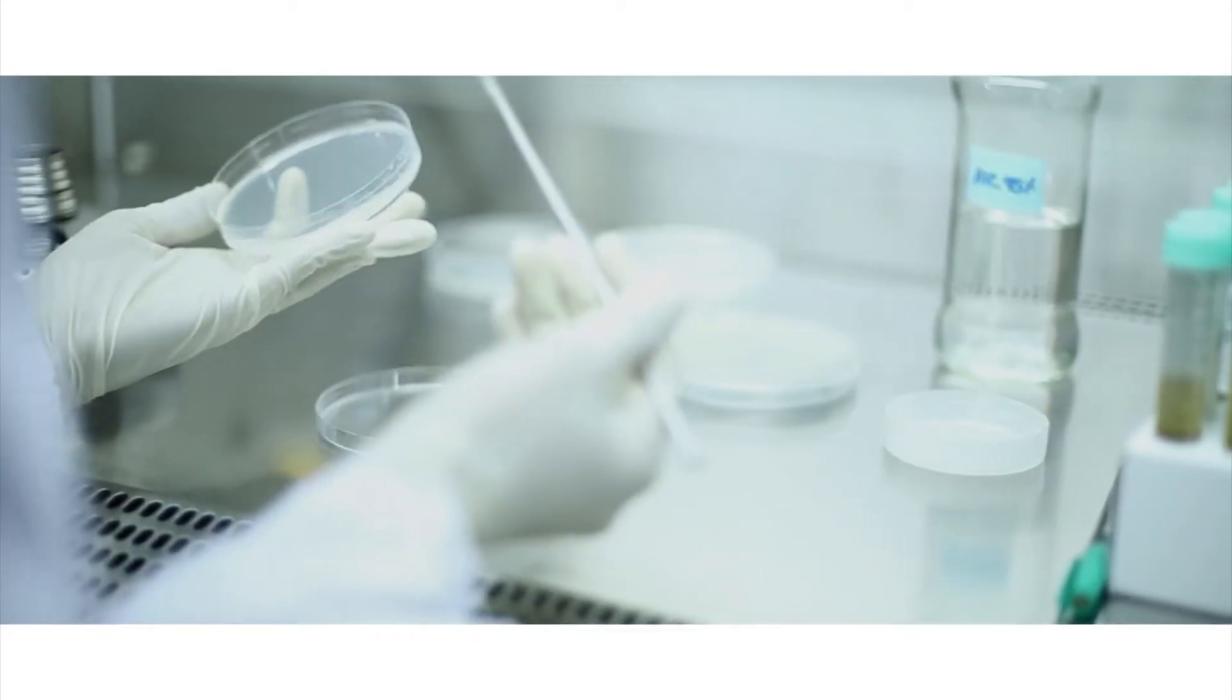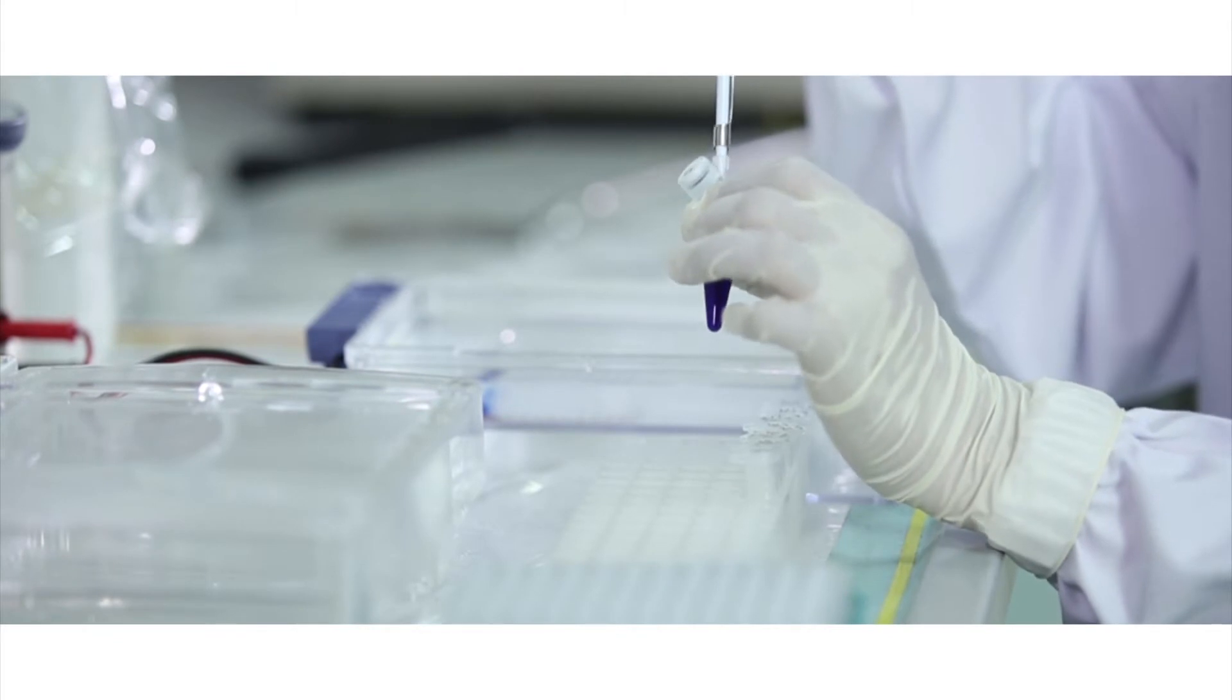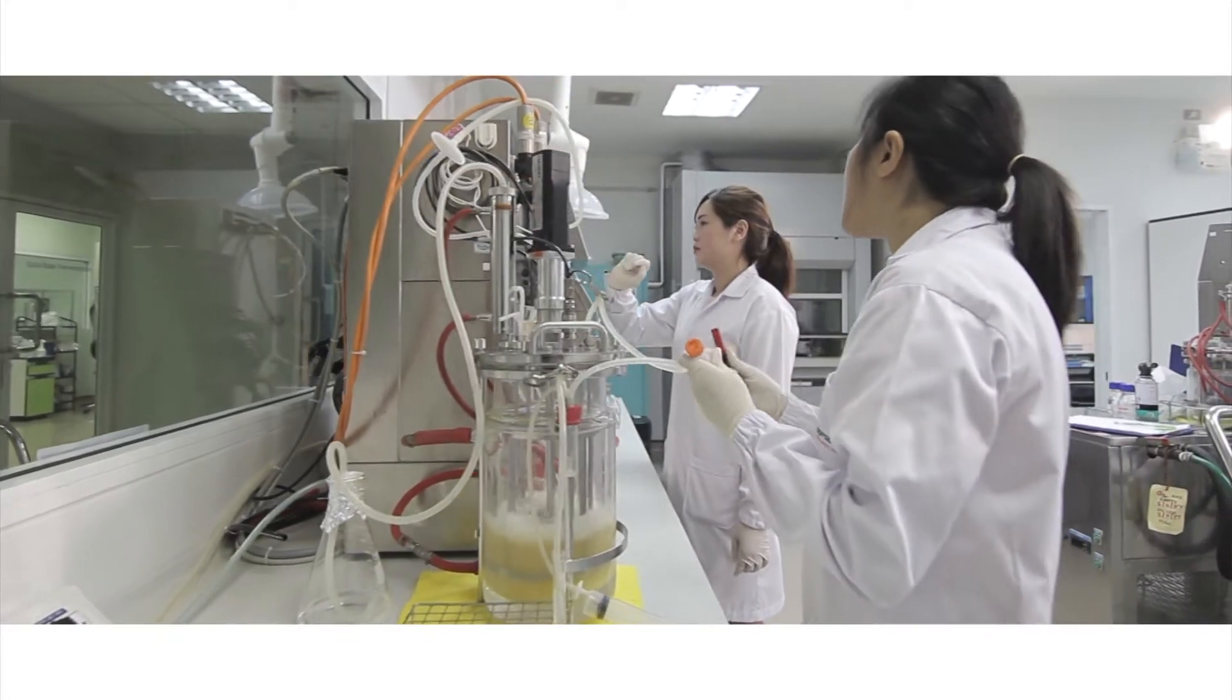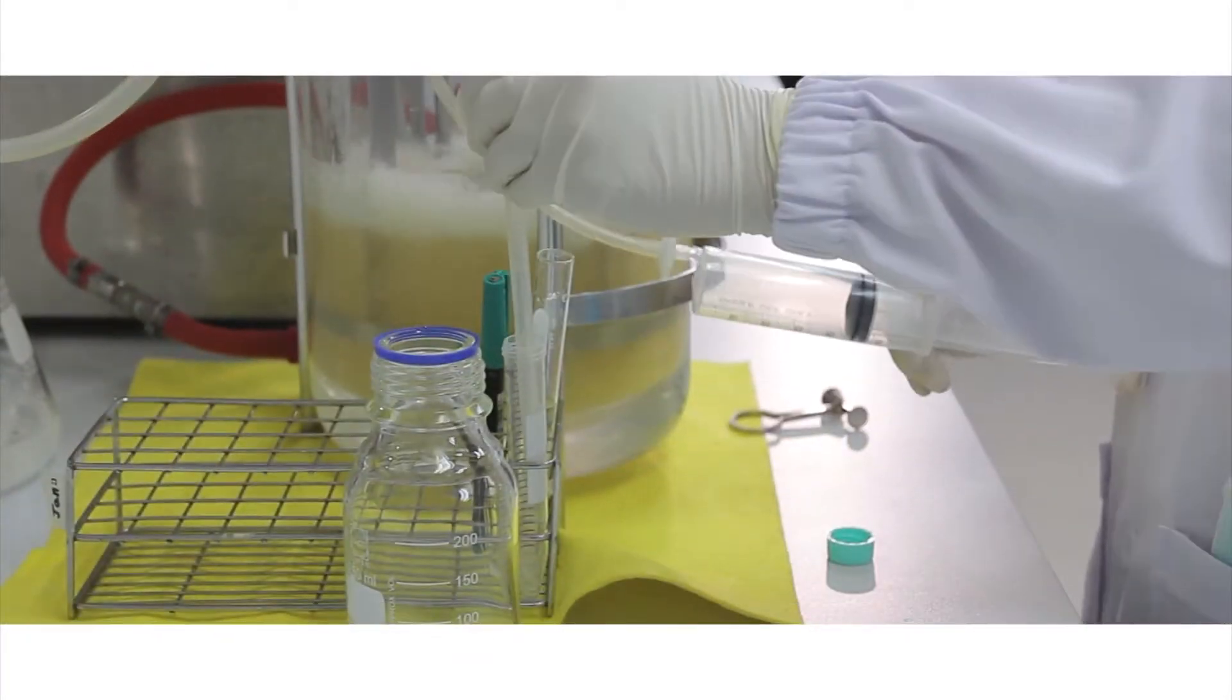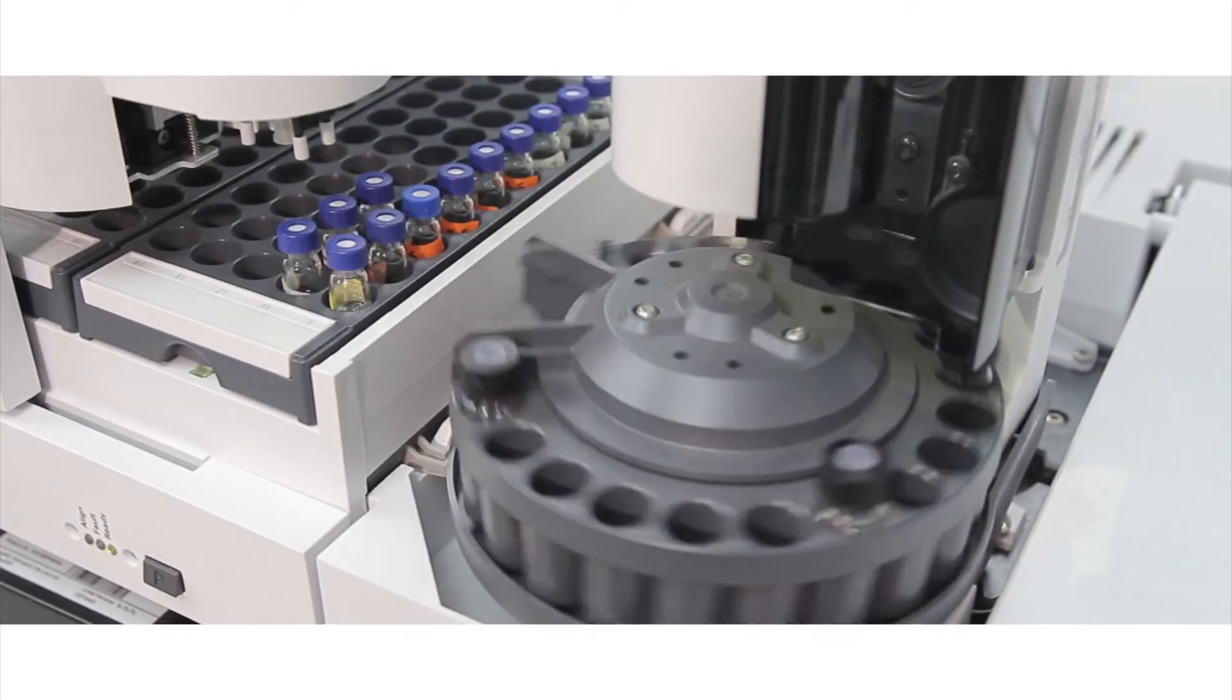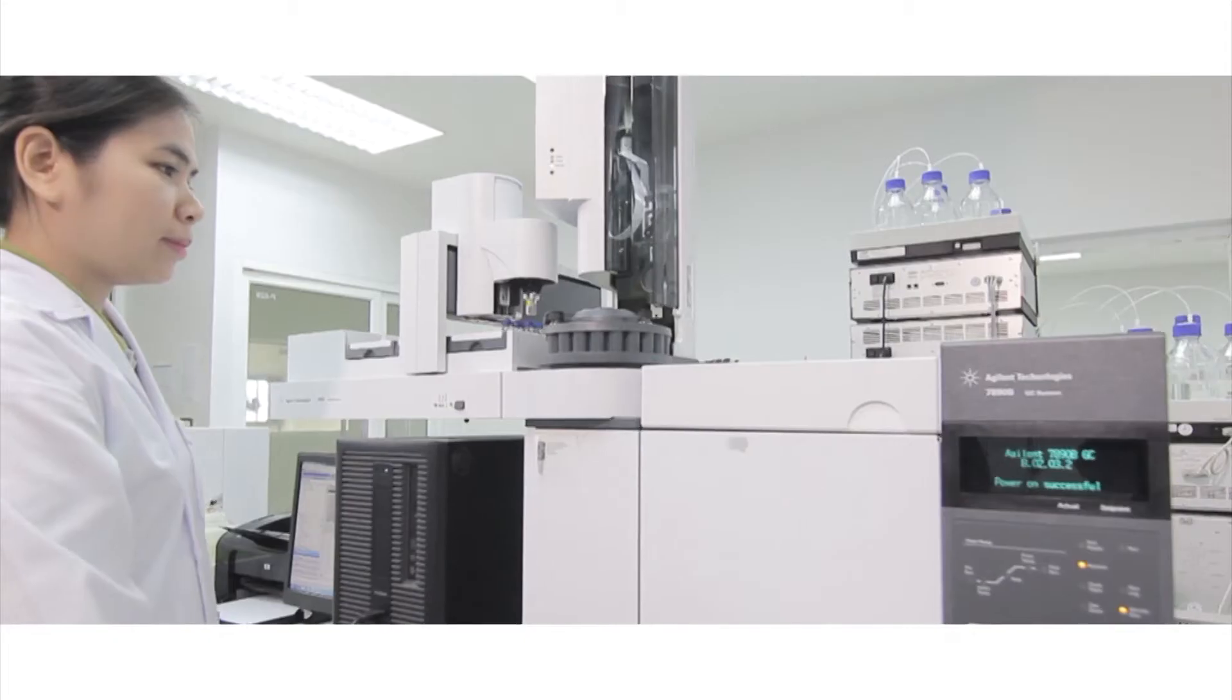The R&D activities are involved in medium design and development, analysis of metabolite and products derived from fermentation, and downstream process. The laboratory is operated under regulatory compliance for conducting research on native and genetically modified microbes.